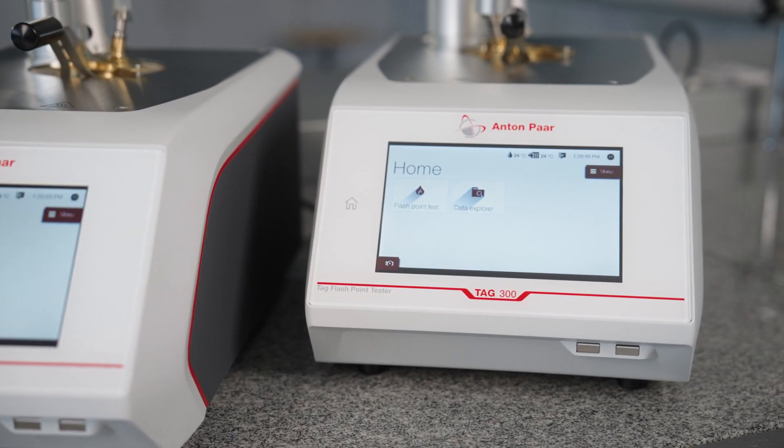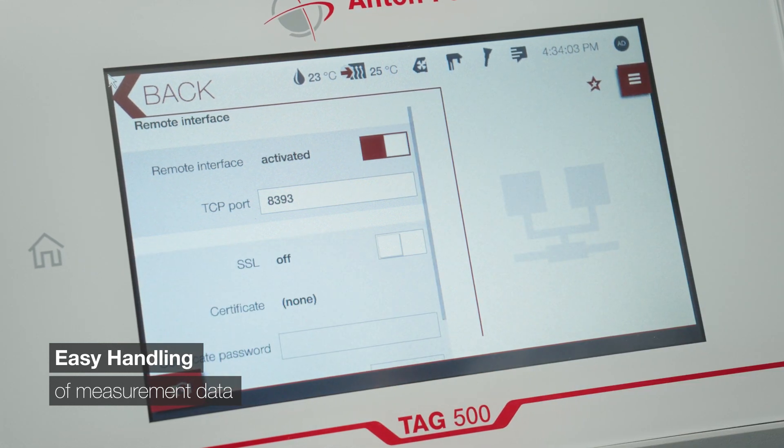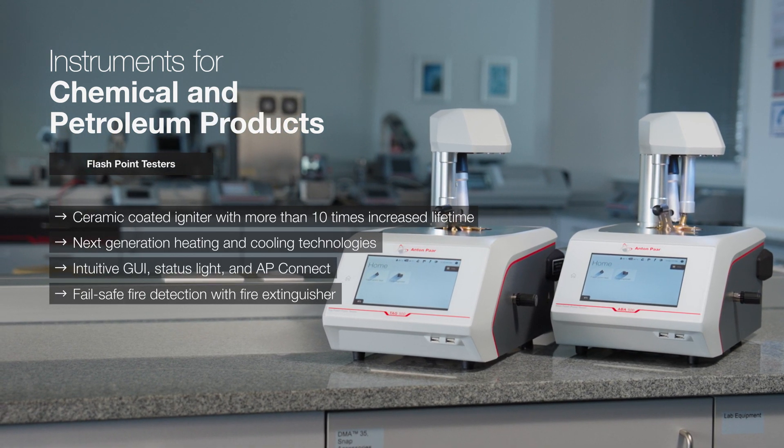And there's perfect connectivity with our lab execution software, AP Connect, so you can manage your instrument's data centrally. Welcome to Next Generation Flashpoint Testing.